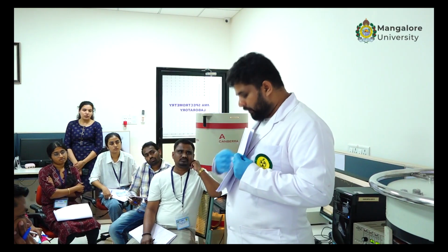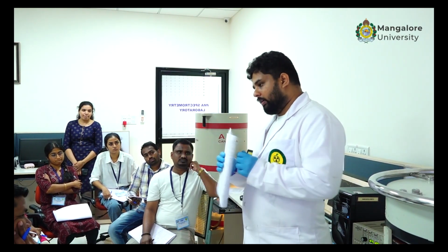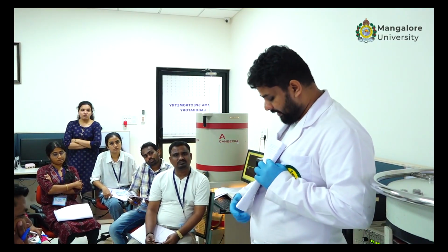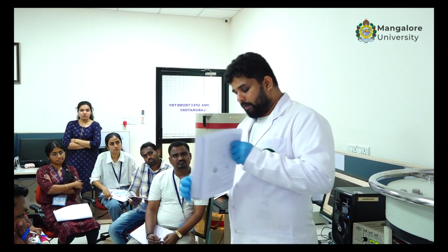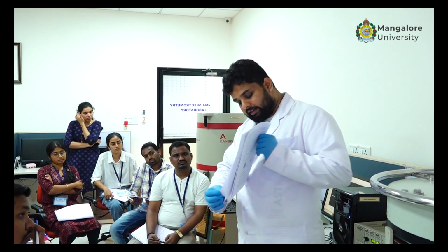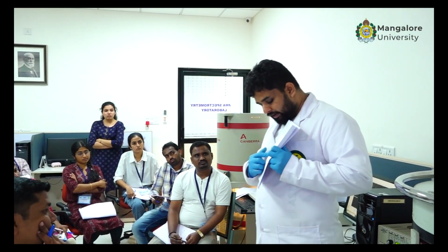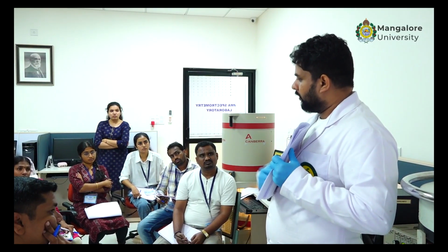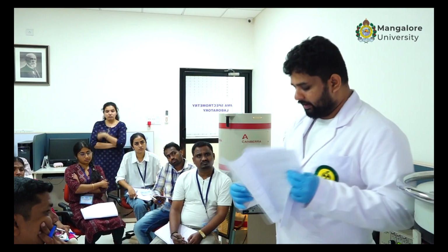They have given the concentration values in sample 2. Here they have given concentrations of radionuclides in samples 6 and 7, and they have asked us how to handle these samples and the choice of methods, and they have given us a deadline before which we have to submit. And the reference for decay correction in all the samples is 1/1/2024, January 1, 2024. That is the reference date.